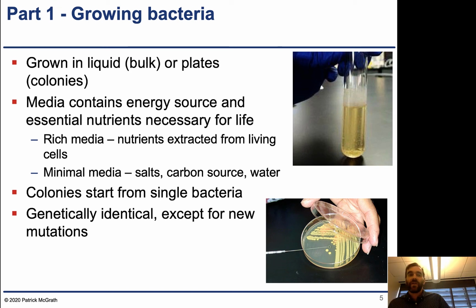Okay, so the first thing we're going to cover is how do you grow bacteria in the lab, and these are some actual physical pictures of how you might grow bacteria if you were doing research in the laboratory. So there's two primary ways that we grow them. One is in liquid culture.